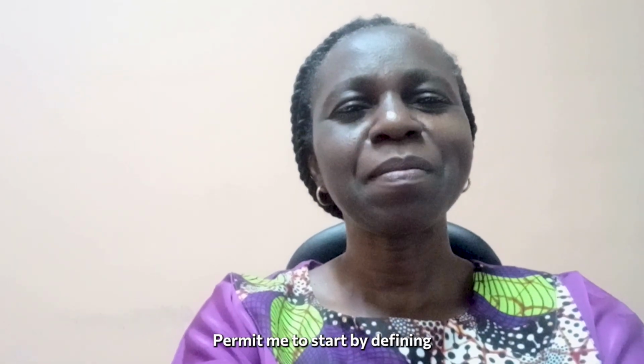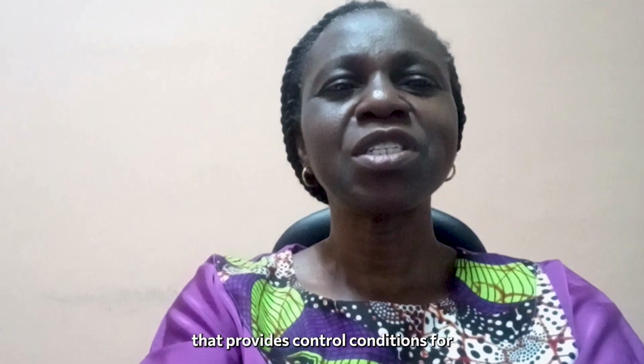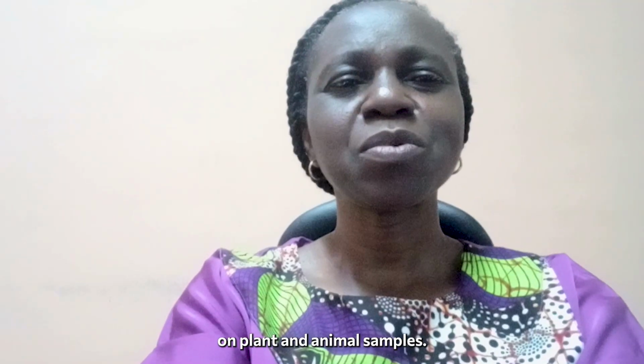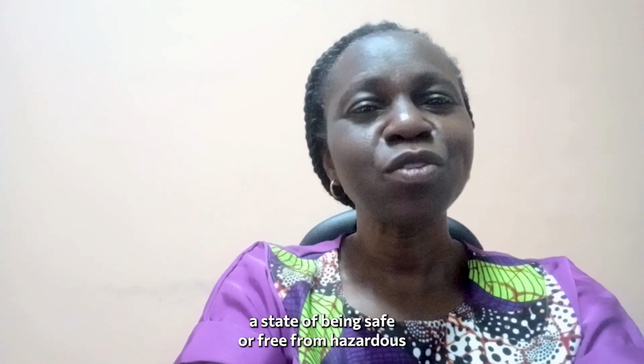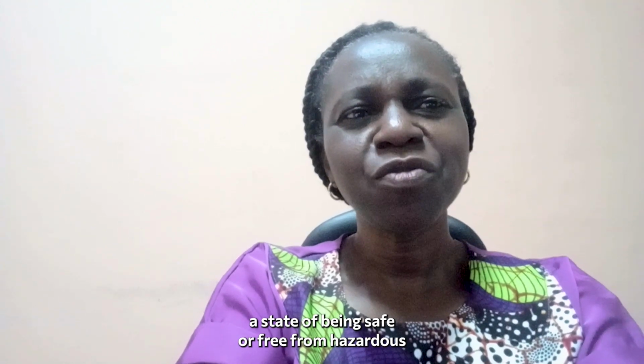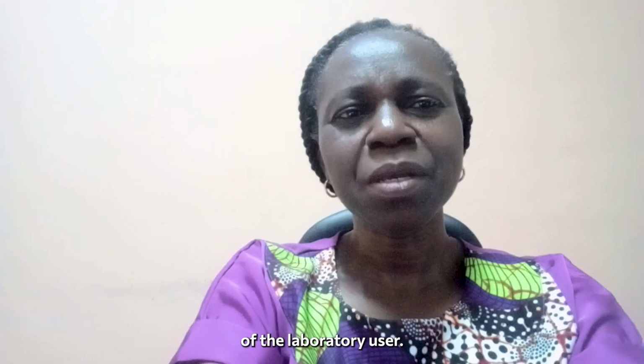Permit me to start by defining what a laboratory is. A laboratory is a facility that provides controlled conditions for conducting research on plant and animal samples. Let me define safety as a state of being safe or free from hazardous or chemical substances that can pose a threat to the life of the laboratory user.